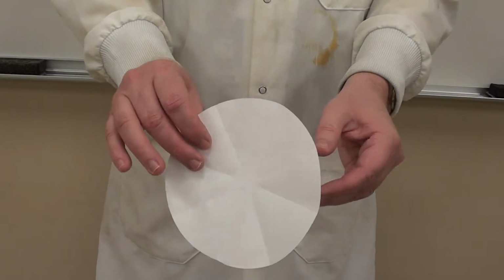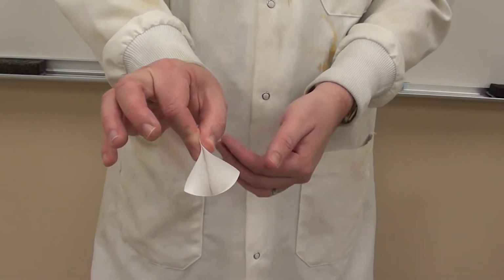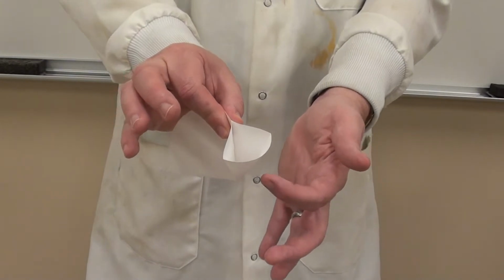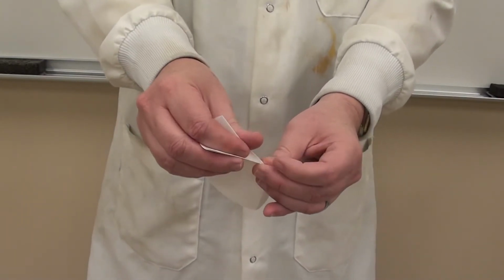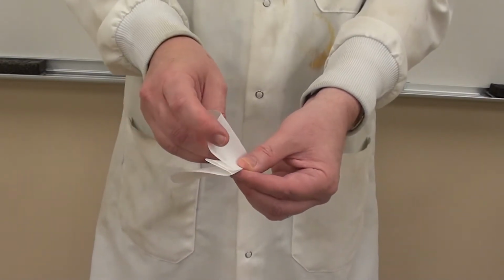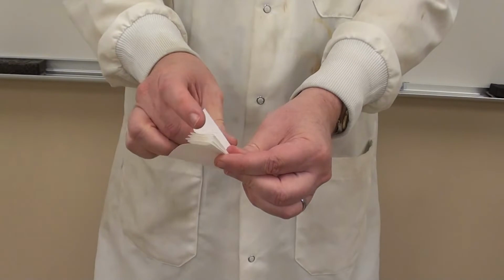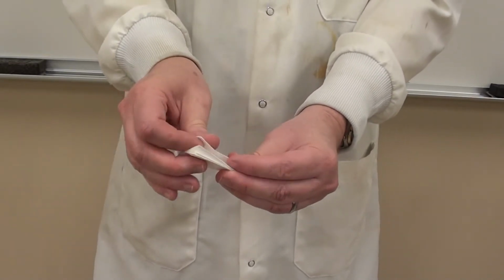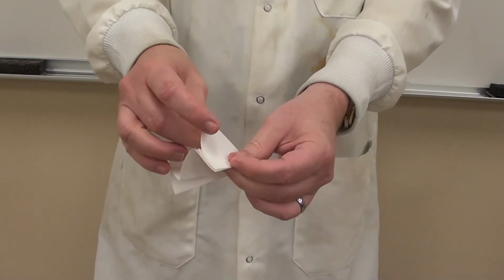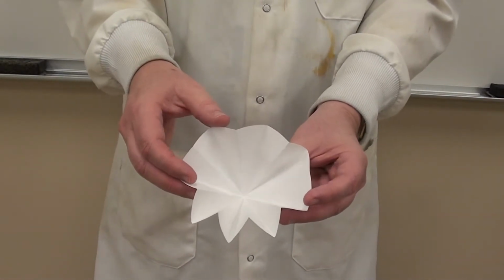The next thing we're going to do, and this is kind of the hard part, is get a single sector that looks like this. A single sector. Hold it on either side, your thumb and forefinger, like this. And then you push in with your finger, kind of like you're making a fan, and then fold it inwards like that. So you've got this here. Then you will fold all of the different sectors over onto that, just like you were making a fan from a piece of paper. Like this. You'll get to this point here, open it up again, fold this one in on itself, and fold this one in on itself. And now what we've got is a fluted filter paper. The benefit of this is that we get to use 100% of the filter area.